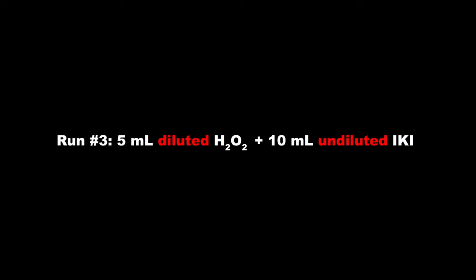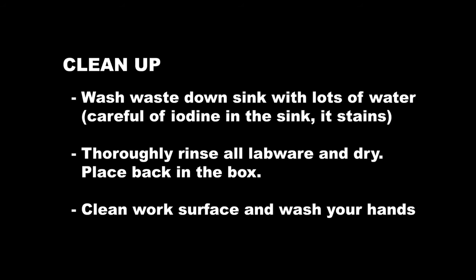In the last run, you'll be using 5 milliliters of diluted hydrogen peroxide and 10 milliliters of undiluted iodine potassium iodide solution. For cleanup, wash all waste down the sink with lots of water, but be careful because iodine can stain your sink, so try to pour it straight down the drain. Thoroughly rinse all your labware, dry it, and put it back in your lab kit box. Clean your work surface with soap and water and wash your hands thoroughly when you're done.